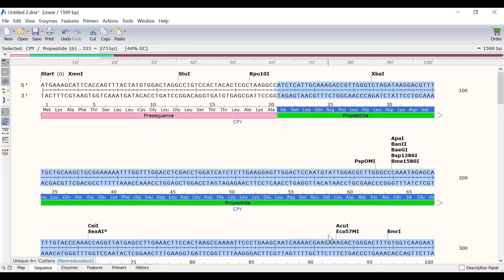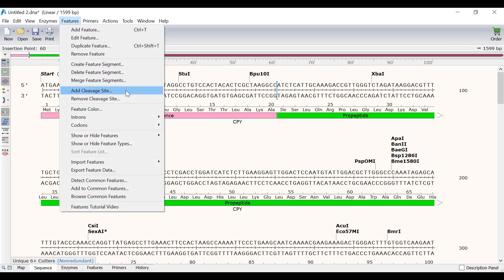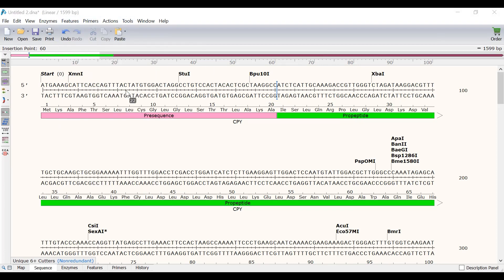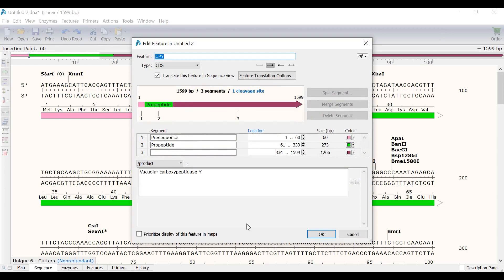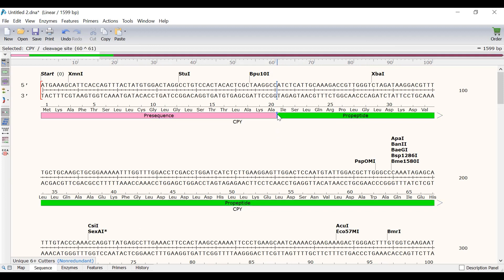Now the pro-peptide segment can be seen. Since both of these segments can be removed by proteolytic processes, I can also add cleavage arrows to denote the segment boundaries. To do this, I will click on the region immediately after amino acid 20. Then I will go to Features, Add Cleavage Site. In the Edit Features window, I will click OK to create the cleavage site. Now you will see an arrow is visible between the two segments, which denotes the cleavage site. I will repeat this process to add a cleavage site after the pro-peptide segment.